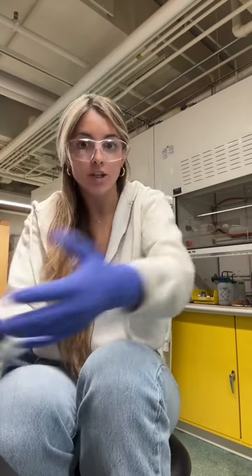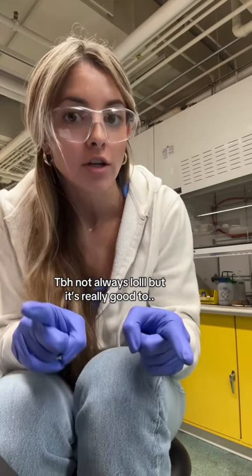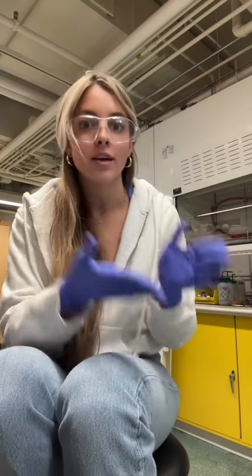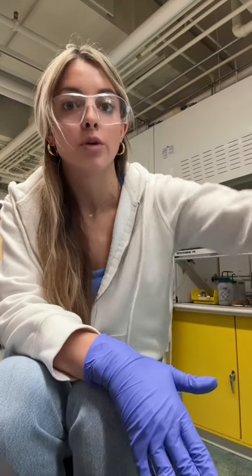But before I just start exposing myself to radioactivity, we always perform cold studies first. We investigate the complexation behavior of our chelator with the stable version, so the non-radioactive version of the metal that I'm going to pursue later on.